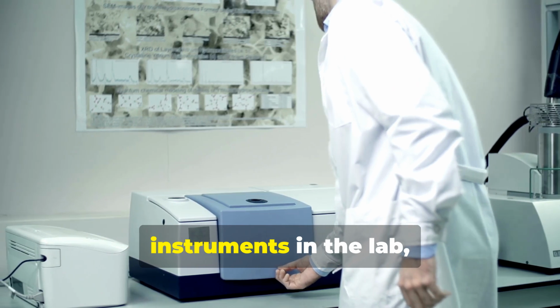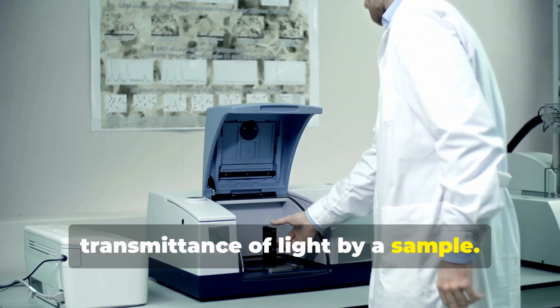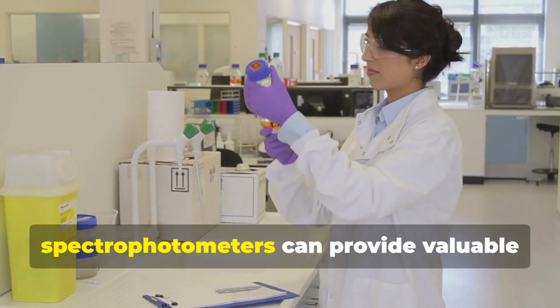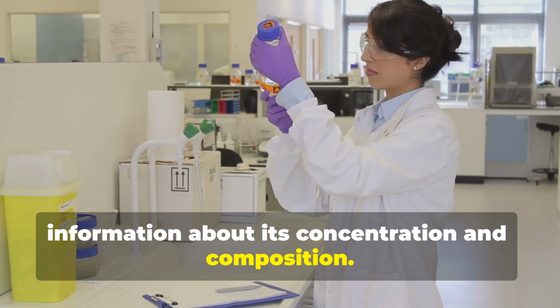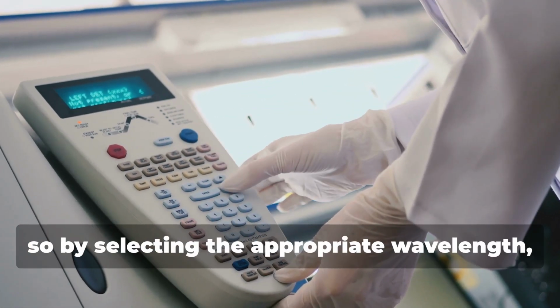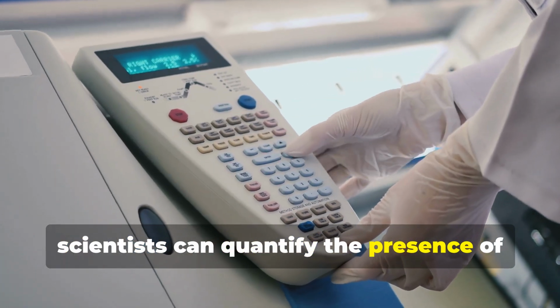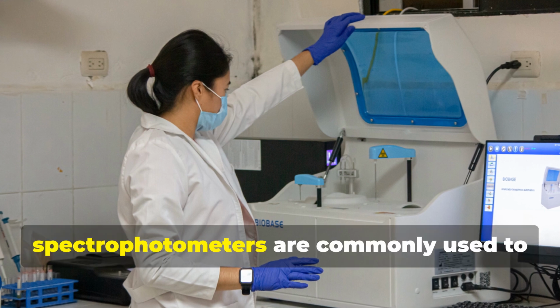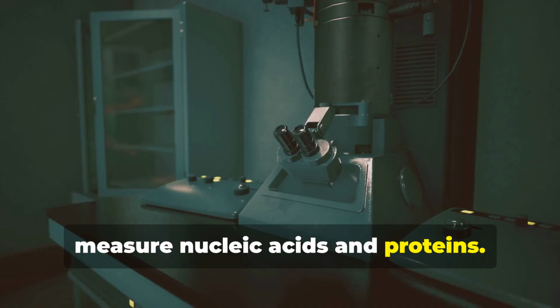Spectrophotometers are vital instruments in the lab, used to measure the absorbance or transmittance of light by a sample. By analyzing how light interacts with a sample, spectrophotometers can provide valuable information about its concentration and composition. Different molecules absorb light at specific wavelengths, so by selecting the appropriate wavelength, scientists can quantify the presence of specific substances in the sample. In cellular biology, spectrophotometers are commonly used to measure nucleic acids and proteins.